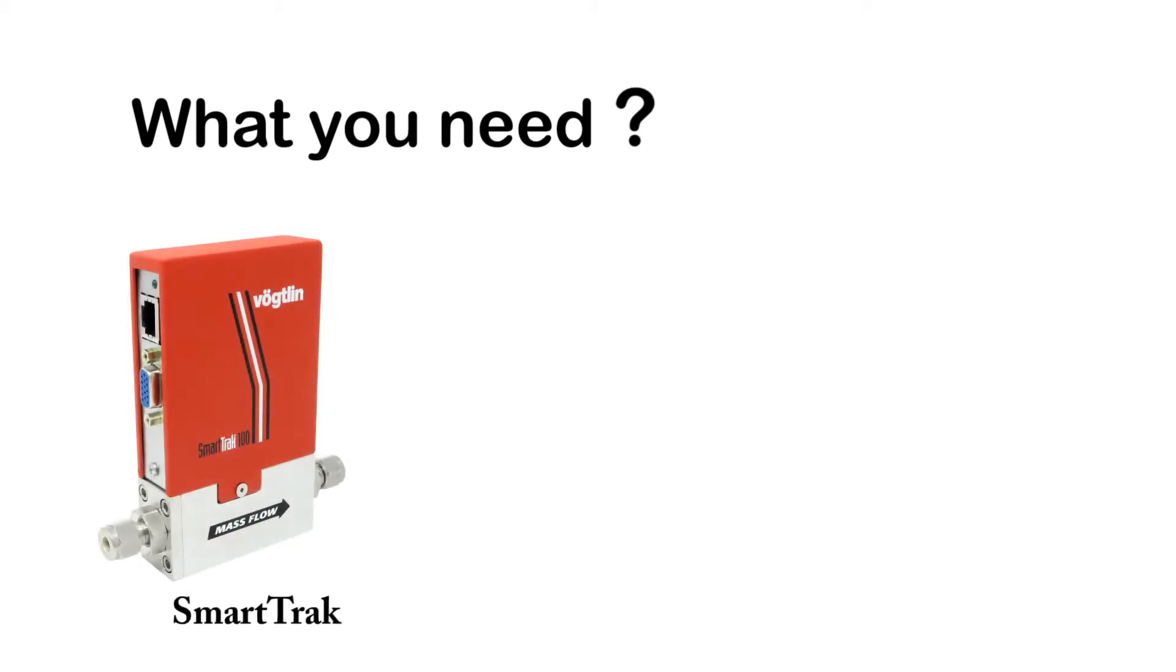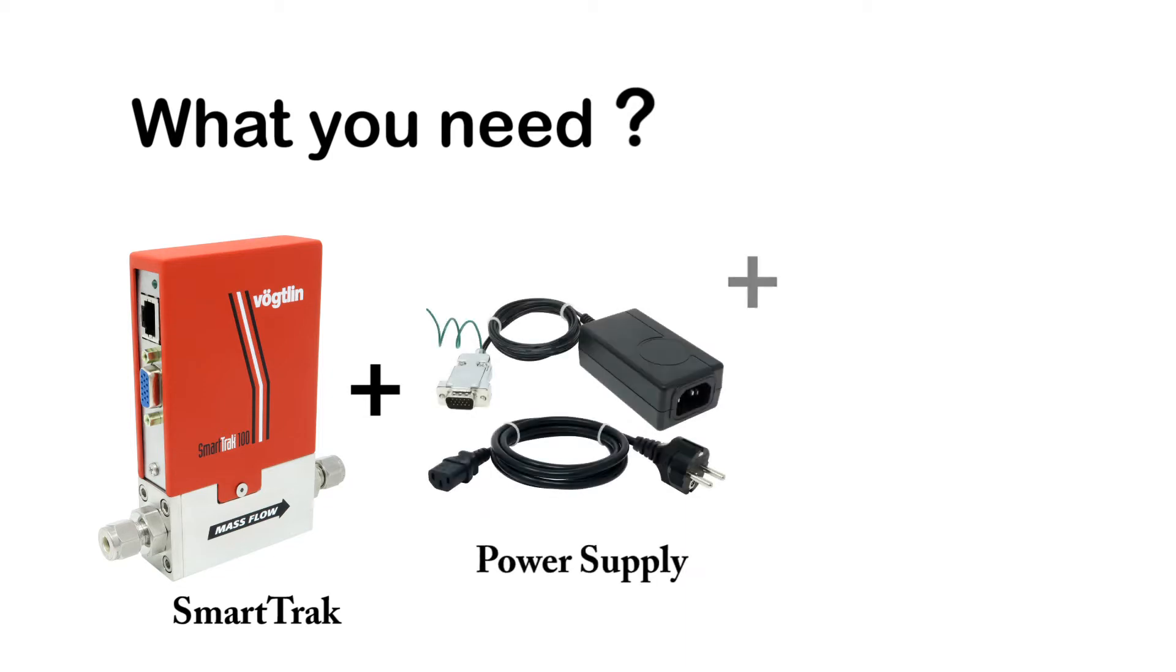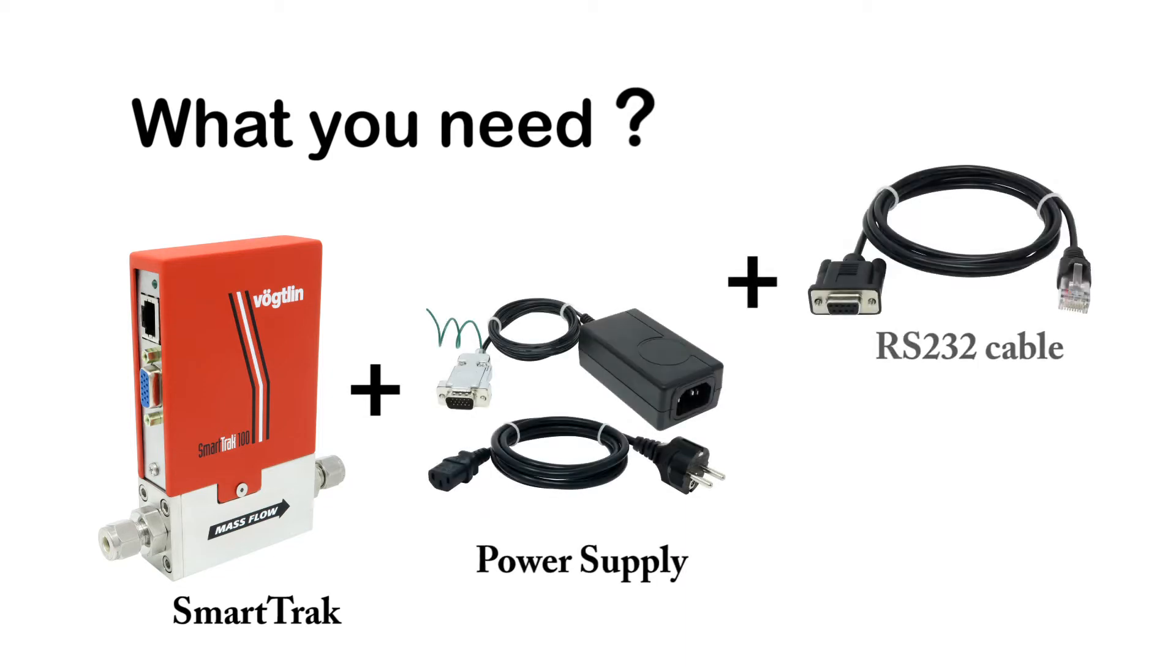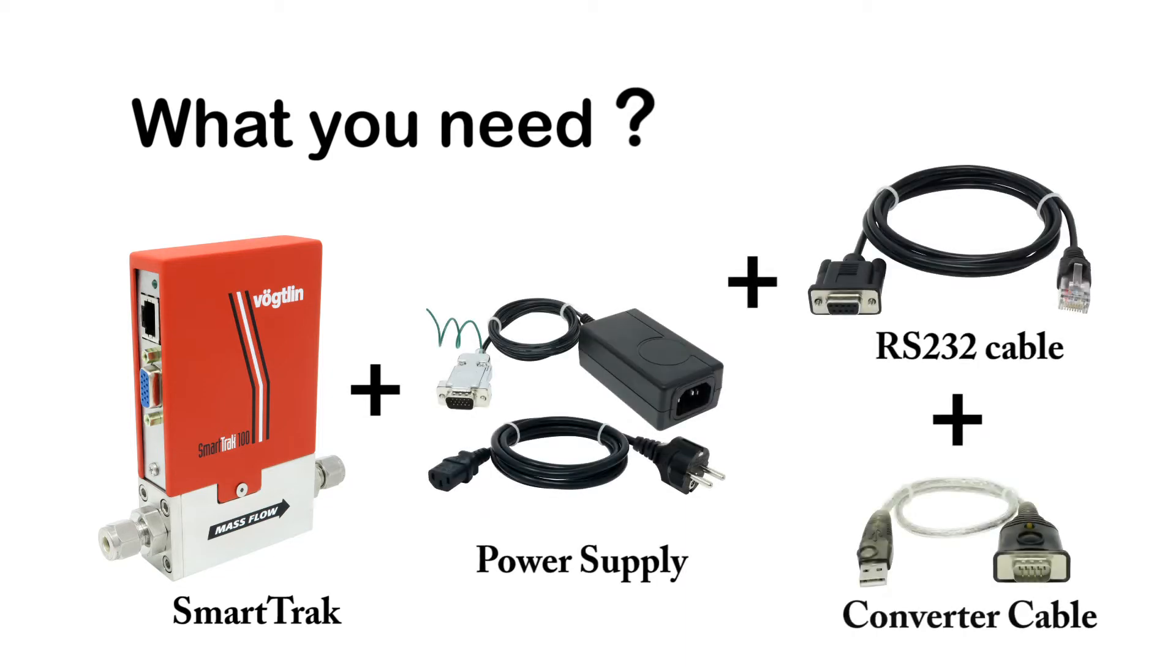What you need to connect the SmartTrak 100 to a computer or laptop: a SmartTrak 100 device, a power supply, an RS232 cable and an RS232 to USB converter cable.